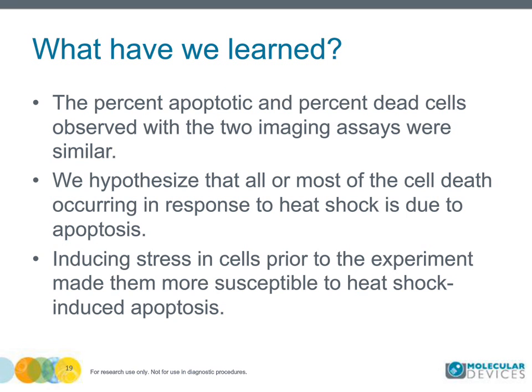So since we also know from the literature that the heat shock does induce HSP70, and that protein is known to have a protective effect on cells from apoptosis, we next looked at the level of the HSP70 protein that's induced in our experimental cells.